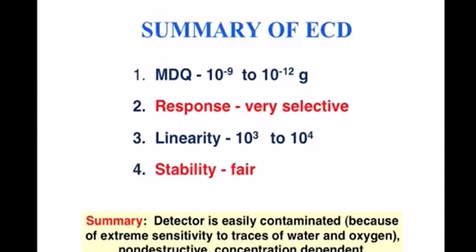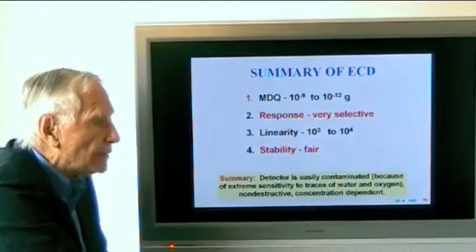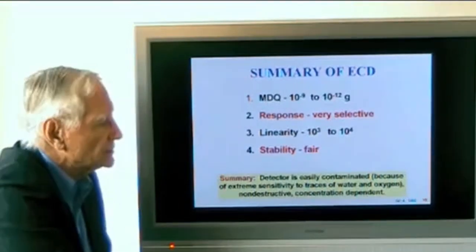Stability is only fair. But in summary, the detector is easily contaminated because of extreme sensitivity to traces of water and oxygen, non-destructive, concentration dependent, but very sensitive and very selective, and widely used for pesticide analysis.